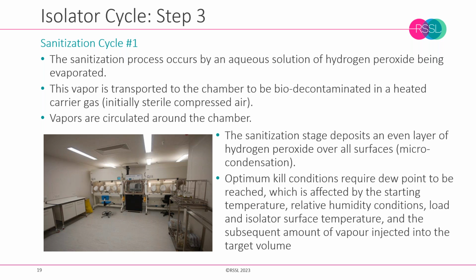I have used ionized hydrogen peroxide. I have struggled with it, but I'm sure there are good technologies out there, but I did find it less easy, less reproducible than higher concentrations of vapor hydrogen peroxide. And the active kill is quite important, and it's about making that contact.